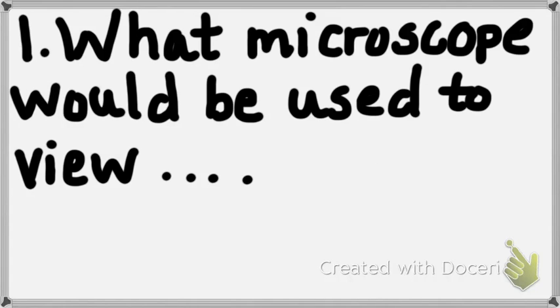Okay, and so guys, that was what I meant for number 1. Have a general idea what kind of microscope would be appropriate for viewing various objects. It's okay on that one. This one's called a stereoscope. And then the other is called the compound light microscope. And again, those are our two scopes that we use in this lab. Stereoscope and compound light microscope.